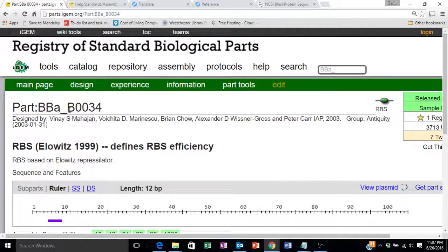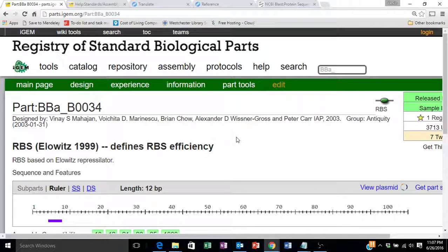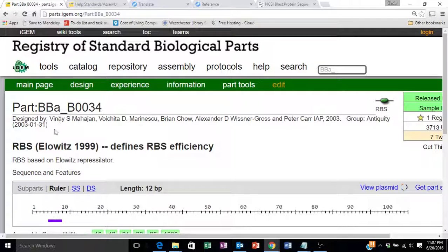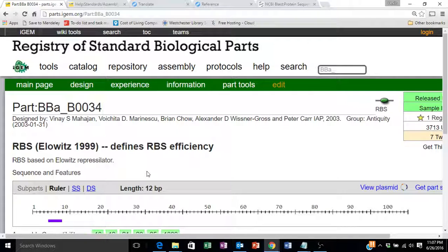By typing in the identifying number or tag for this part, we're given a page describing the part: who designed it, the name of the part, some features and description.